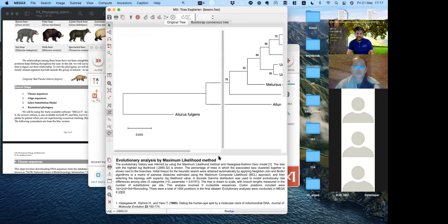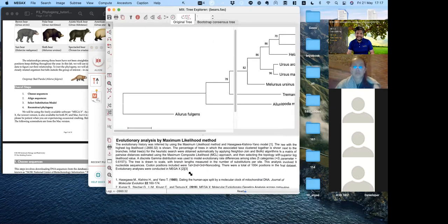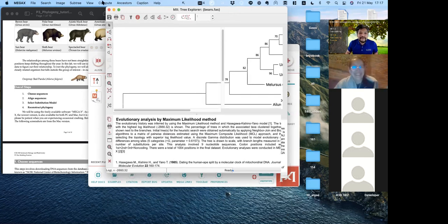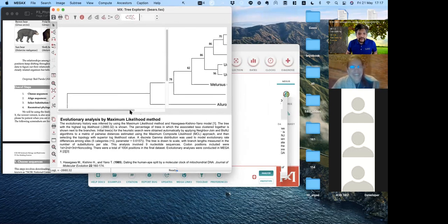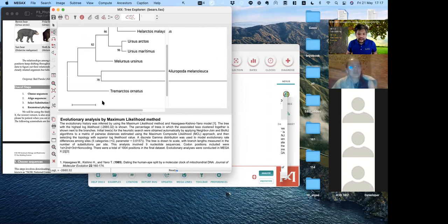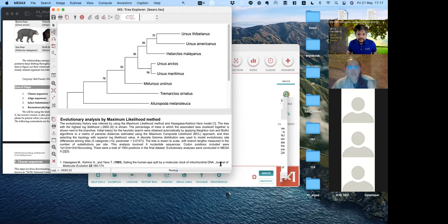What just happened here? Okay, it's supposed to work, but so you click here and it brings this icon, and you just bring the icon to the branch you want to reroute, and it should reroute for you. So you can click this and use the icon to reroute your tree as well.